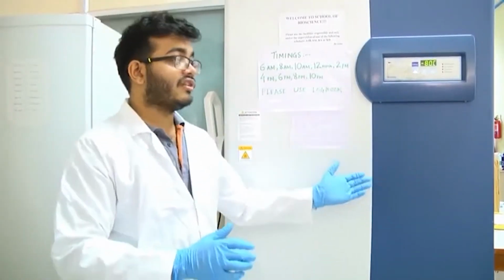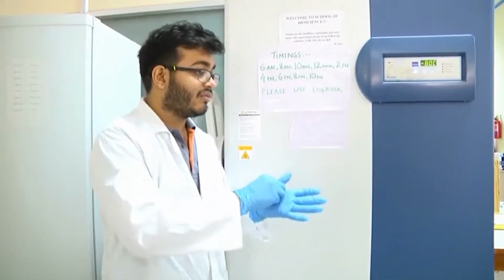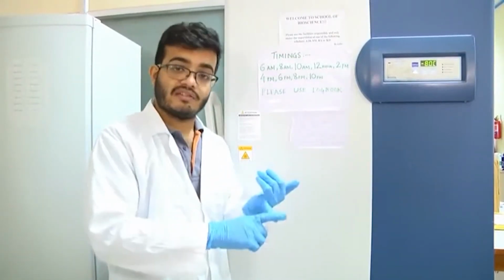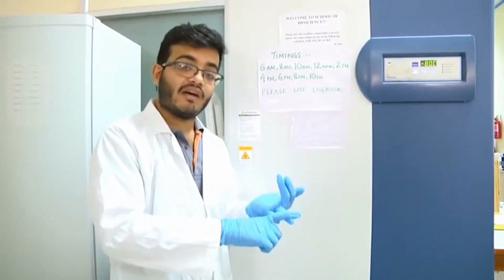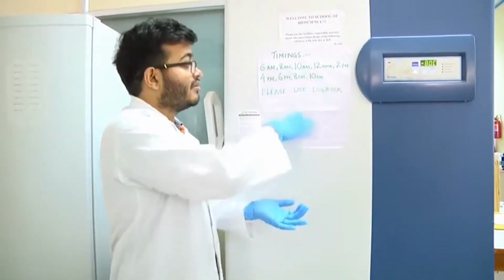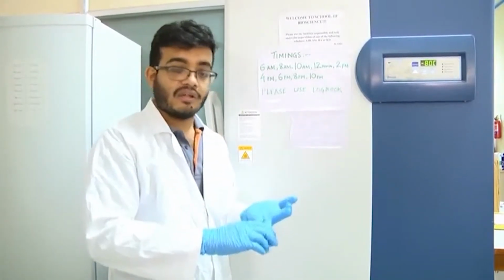Today, just for an educational purpose, I kept it open for some time. So, the bottom line is, when you are working with minus 80 degree centigrade, you have to be fast, and if possible wear cryoprotectant gloves, because it is actually very cold. The metal surfaces, do not touch them for too long or you might get some cold burn.